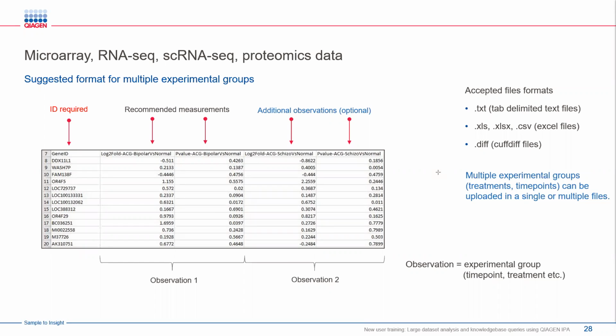The reason I say that is because imagine if you put all your genes in your analysis, everything will show up as activated and inhibited. You're not going to be able to find the most significantly enriched pathways. You won't be able to find the real biological interpretation from your data if you include all your 20,000, 30,000 genes. So that is why we limit these numbers to a workable number, which makes sense when generating the results from the data.